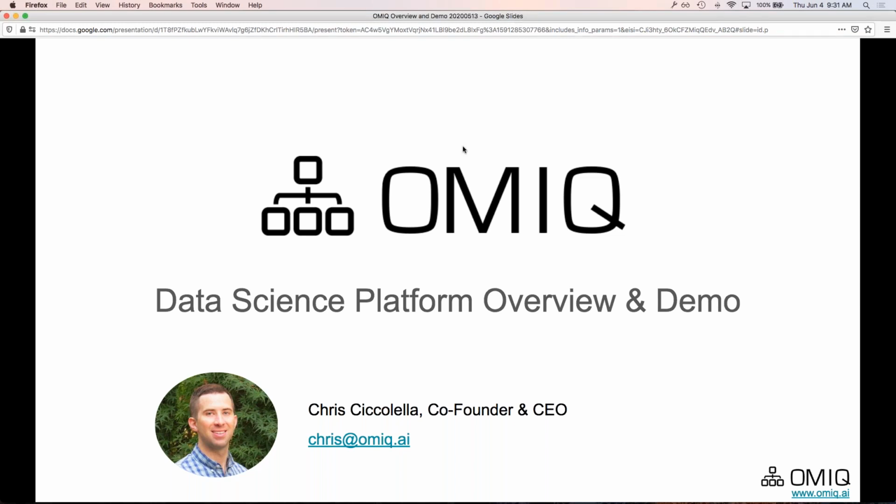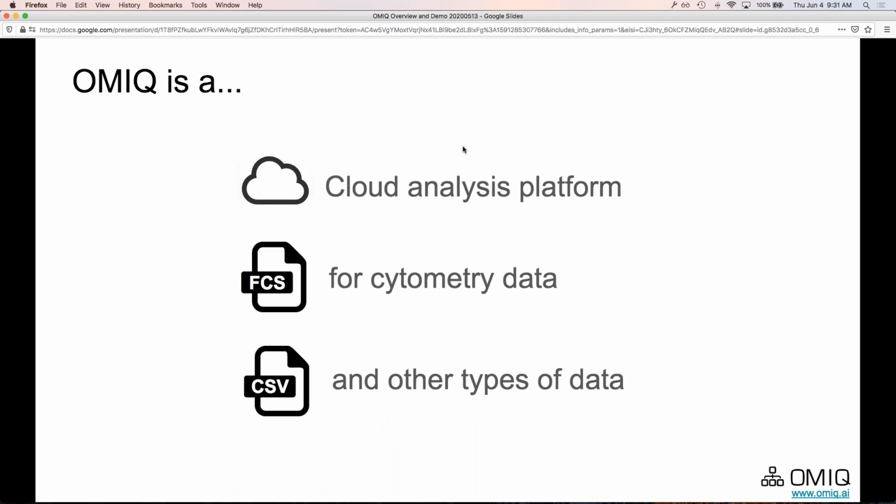Okay, great. So thanks a lot for that intro. And hi, everybody. I'm happy to be here today to talk about OMIQ. OMIQ is a new data science platform that we've developed for single-cell biology. Real quick, the executive overview of what OMIQ is is that it's a cloud platform. And primarily, we've built it with cytometry in mind, but also recognizing that more and more these days, there's sort of an integration of different types of workflows and needs within quantitative cellular analytics.